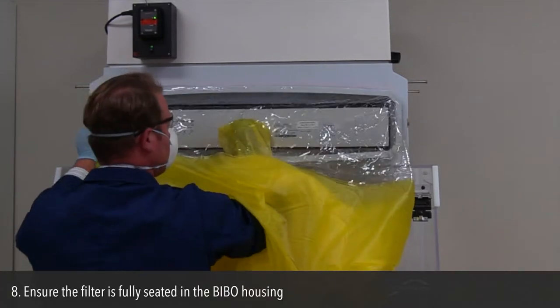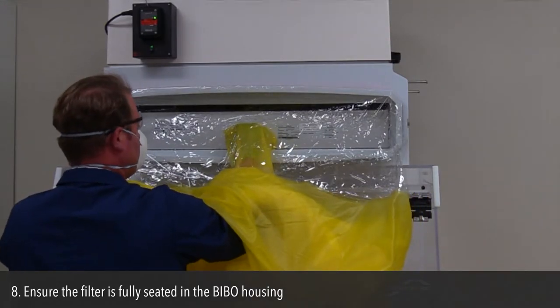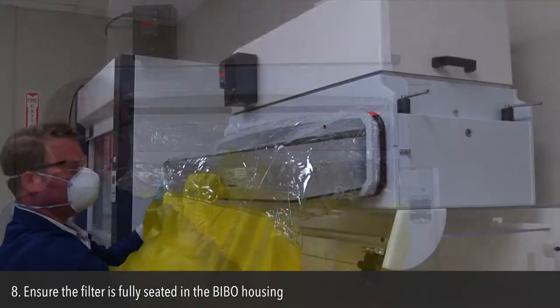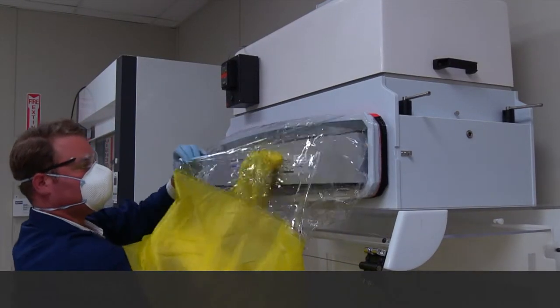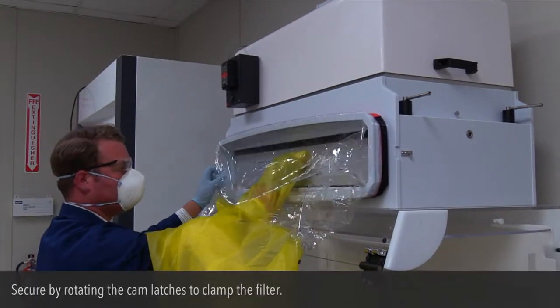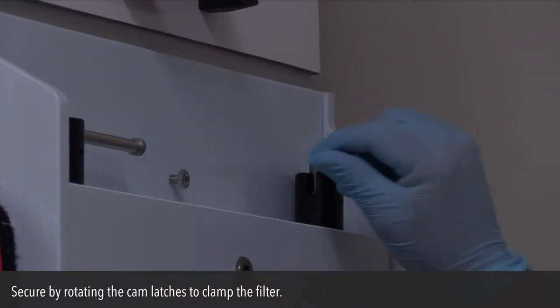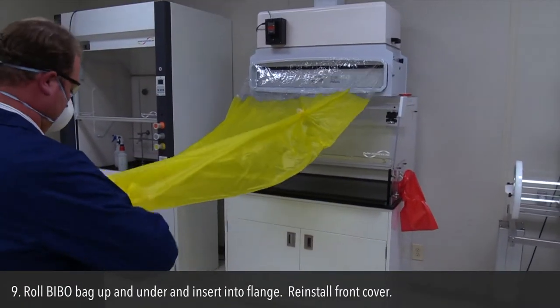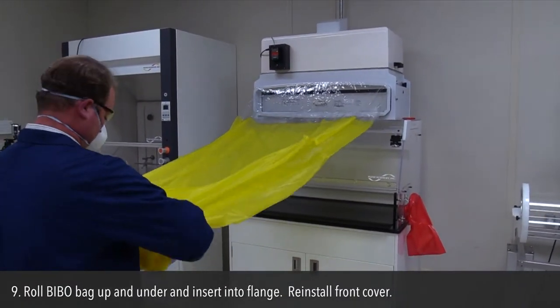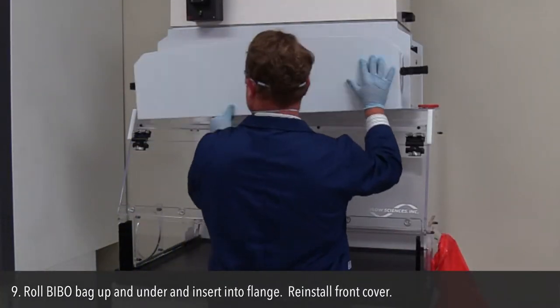Step 8: Ensure the filter is fully seated in the BIBO housing. Secure by rotating the cam latches to clamp the filter. Step 9: Roll the BIBO bag up and under and insert into the flange. Reinstall the front cover.